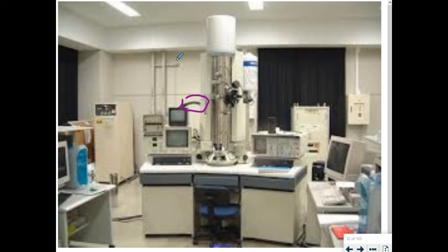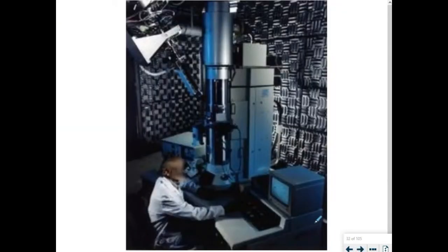As you take a picture and blow it up bigger and bigger, the resolution may not match it. And if you blow a picture up bigger and bigger, you may not actually be able to tell the differences between different sides here. I think this particular picture is a little bit better in its resolution. That being said, look at this scientist's hair right here. Can you actually see individual strands of hair? Well, no. But I can tell you these markers on the wall, I can see the differences between them. So anyways, I really want to make sure you understand that magnification is not resolution.